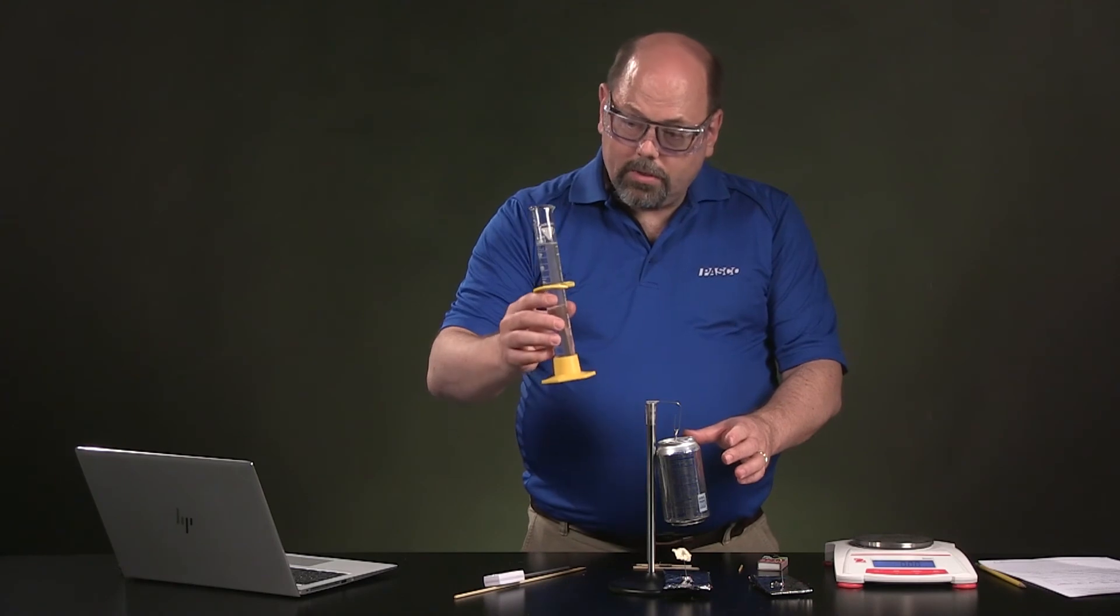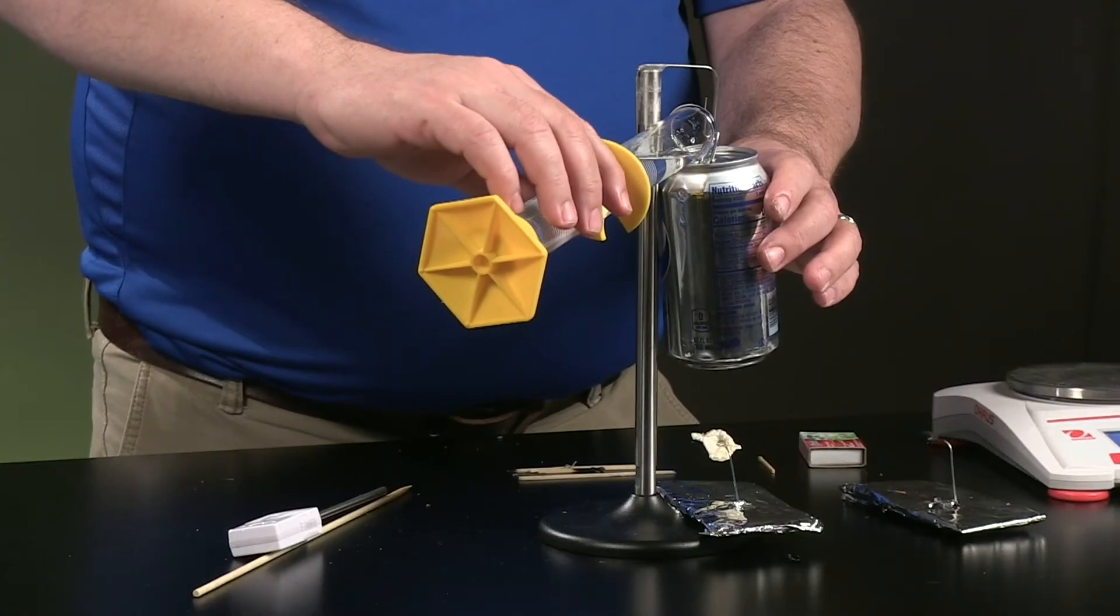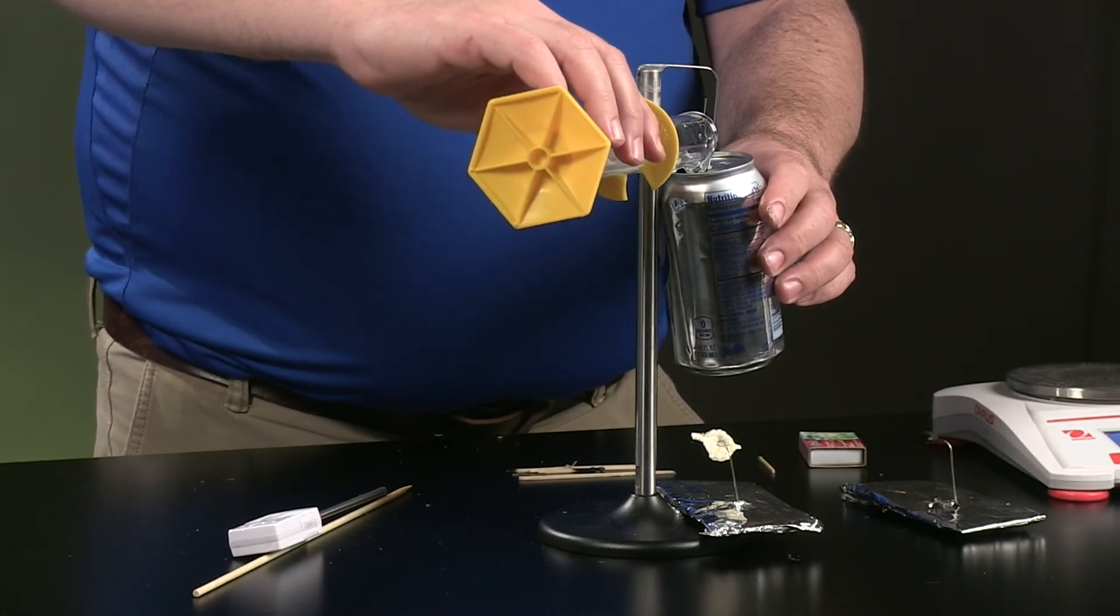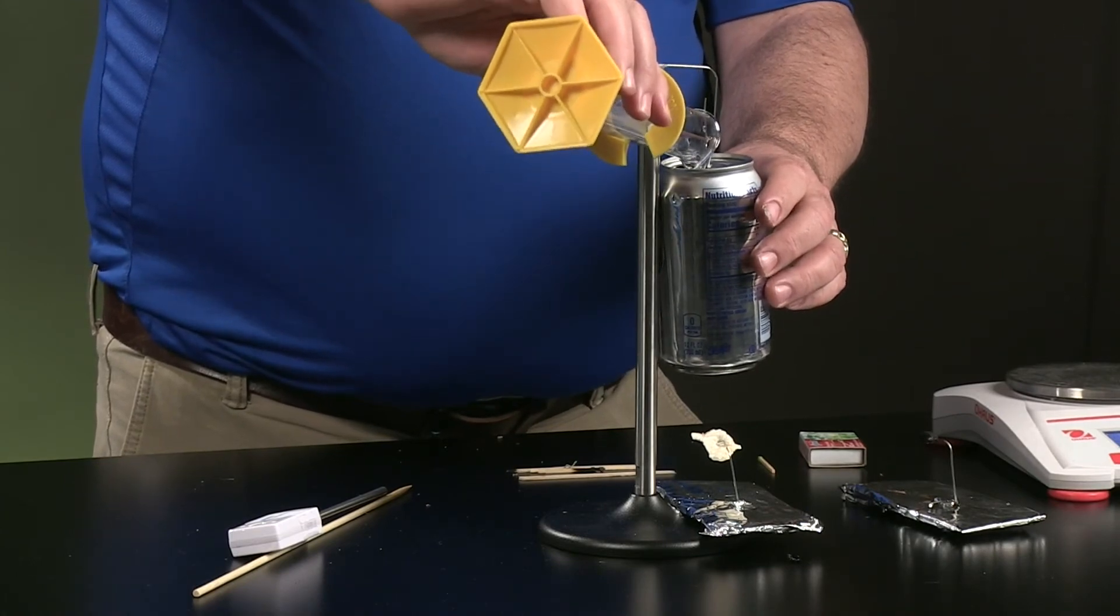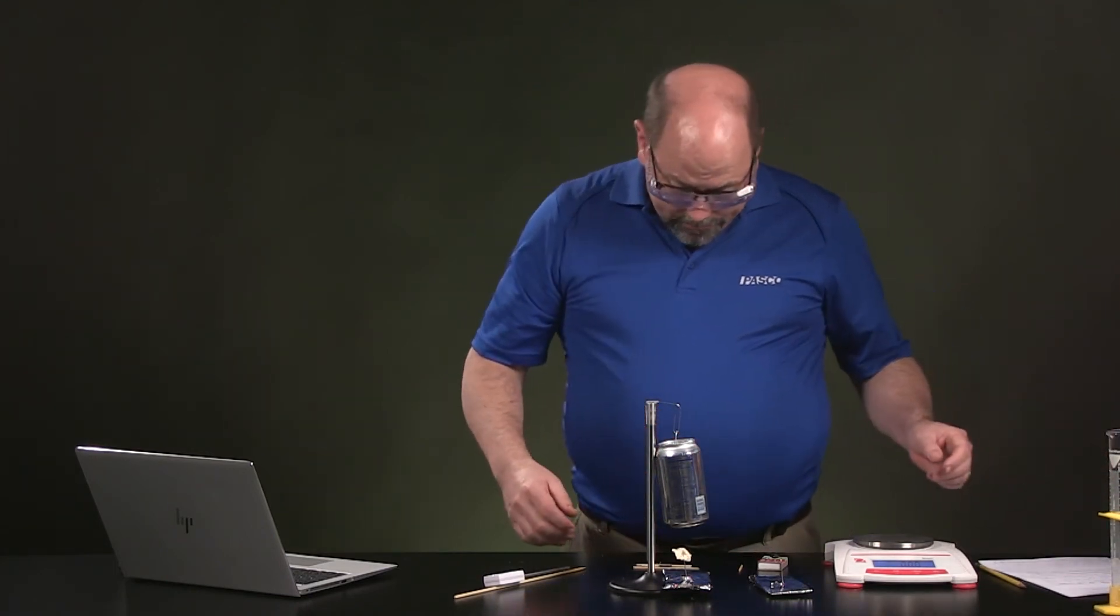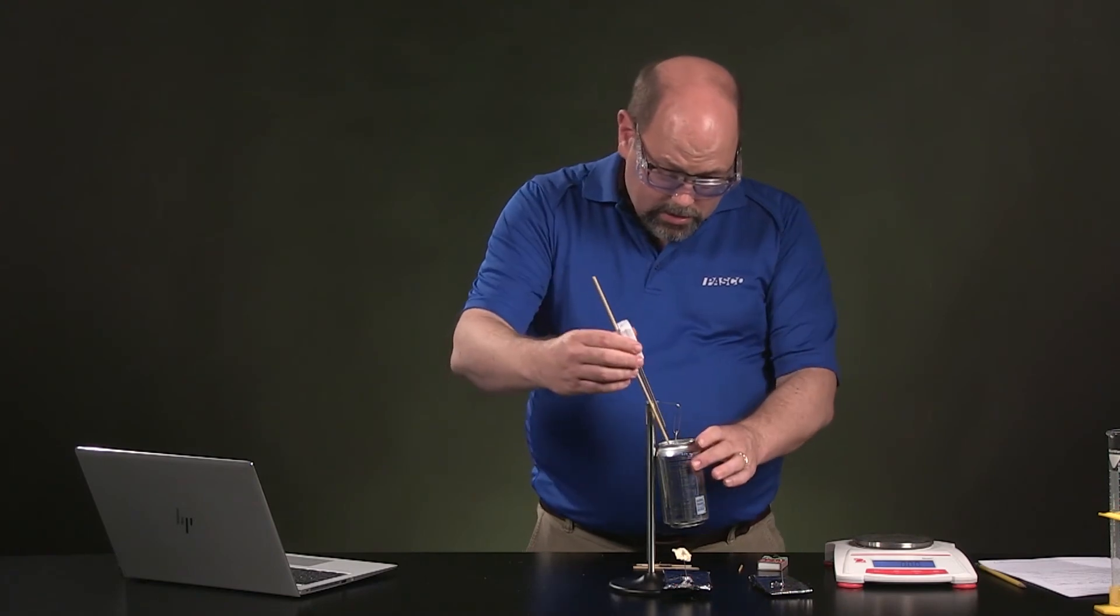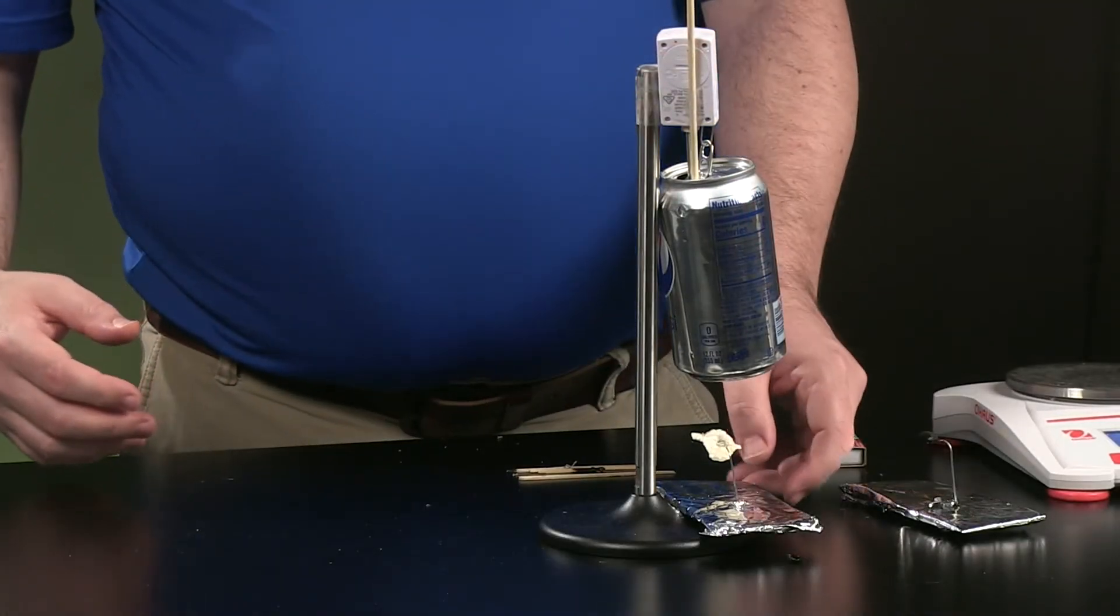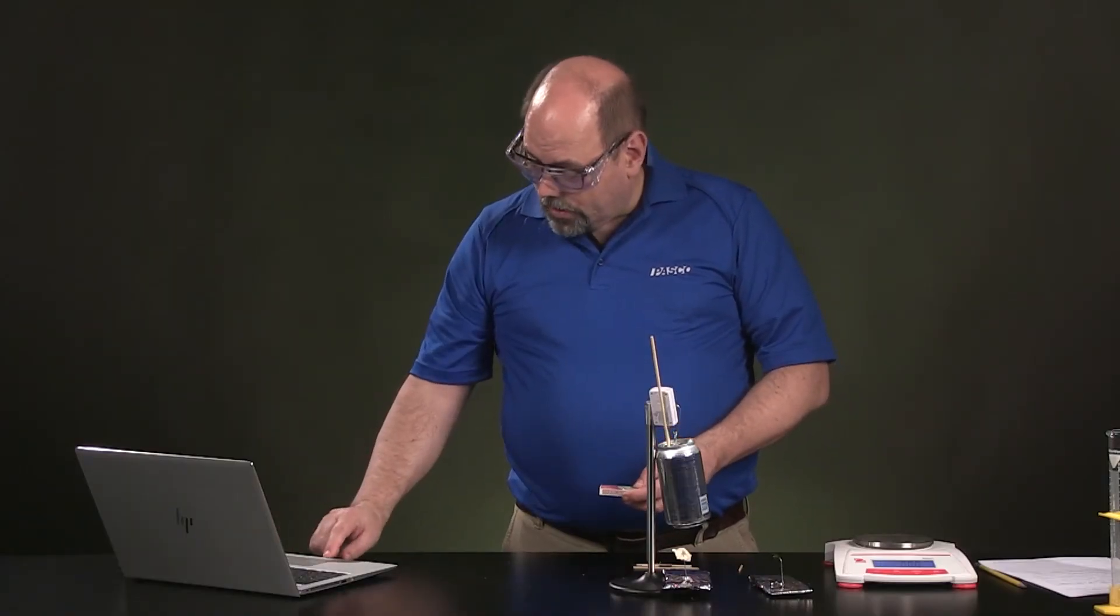Now we're going to pour a new 100 ml water sample into our calorimeter. And if you're just doing this and you have two cans, that would be another way you could do that pretty quickly. Let's put our thermometer back in. Make sure the marshmallow is right underneath. I'm going to go ahead and start a second run.